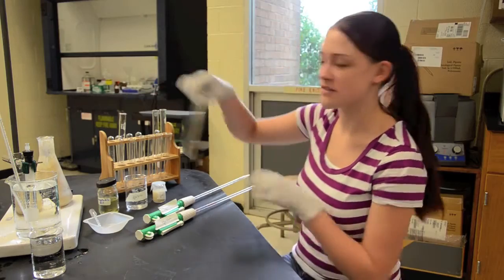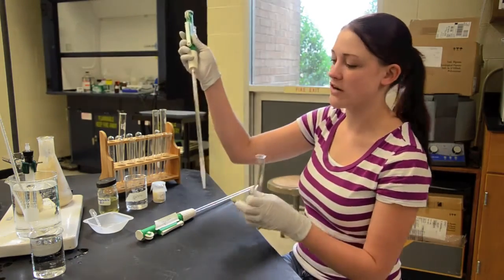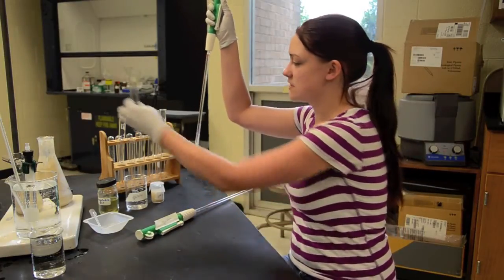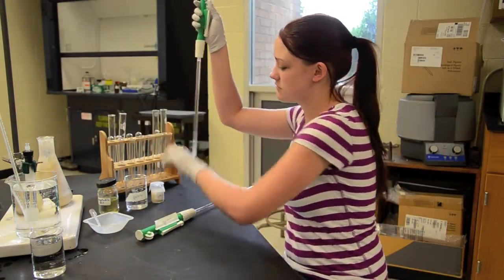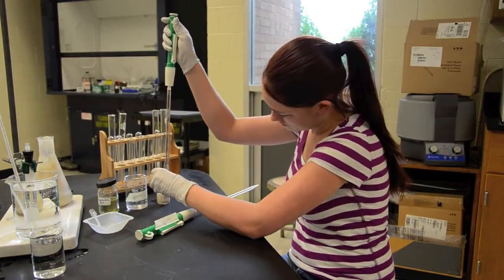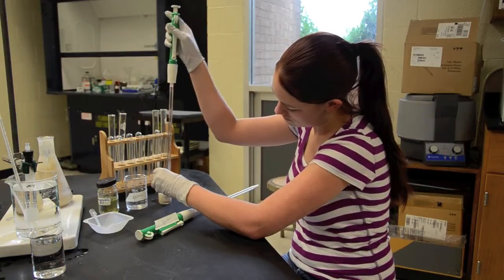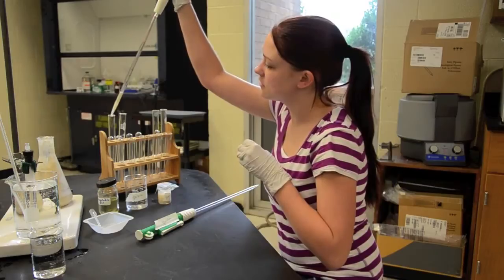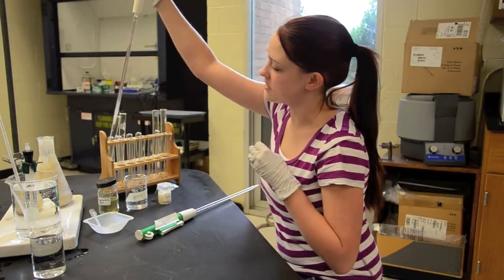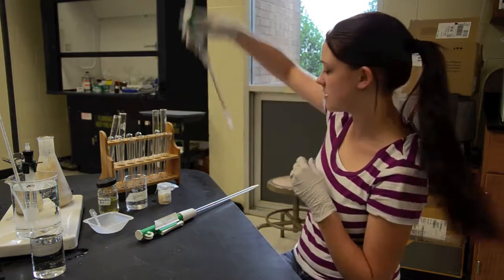The first thing you want to do is get a clean test tube. You're going to add two and a half mls of yeast to the test tube. Pull up to two and a half mls, recover the yeast, and put them in the test tube. Notice that I've used a dedicated pipette labeled yeast, so you know what was in there.